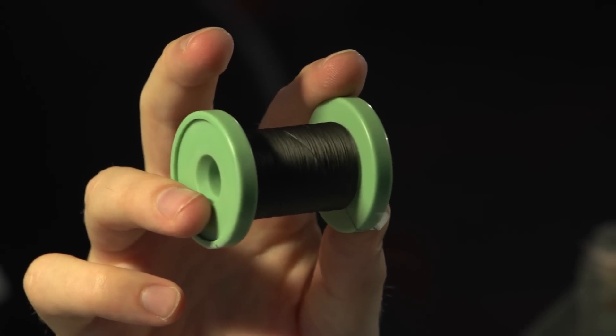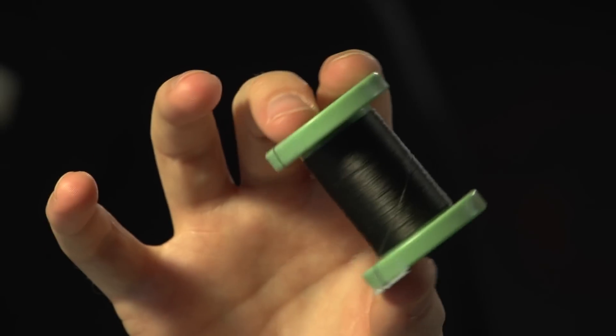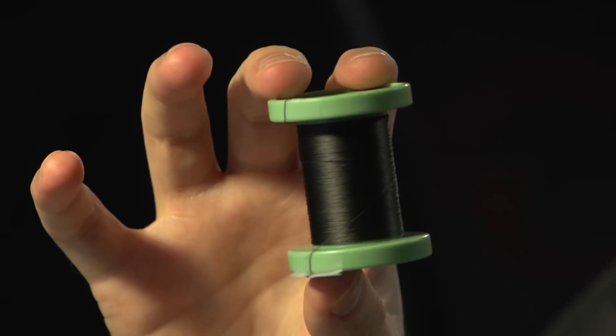This is a spool of the fiber after it's been spun and wound. This is one continuous filament. This was produced in a single spinning experiment where we spun a continuous filament and were able to wind it onto a spool like this.